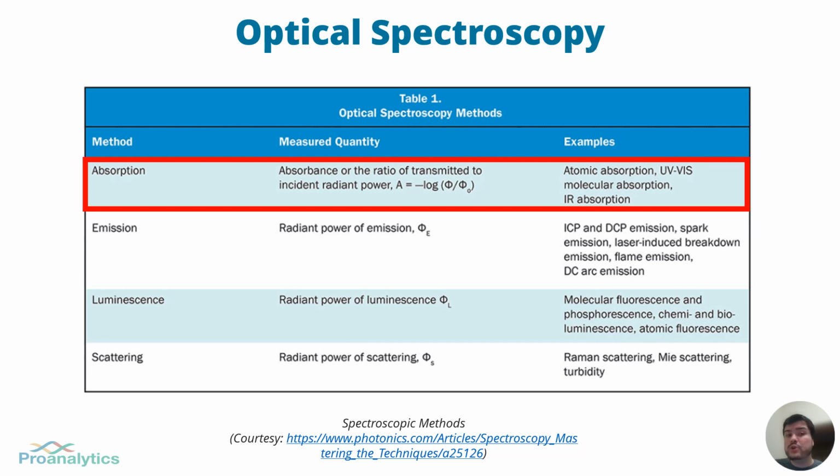So let's start with absorption spectroscopy. The most common method of absorption spectroscopy is near-infrared spectroscopy. The absorbance of incident light in the near-infrared region of the spectrum, which consists of wavelengths from 780 nanometers to 2500 nanometers, differs from molecule to molecule, which yields a unique spectrum within the NIR region of the light due to Beer-Lambert law that relates the attenuation of light to the absorptivity and concentration of the sample through which the light is traveling.